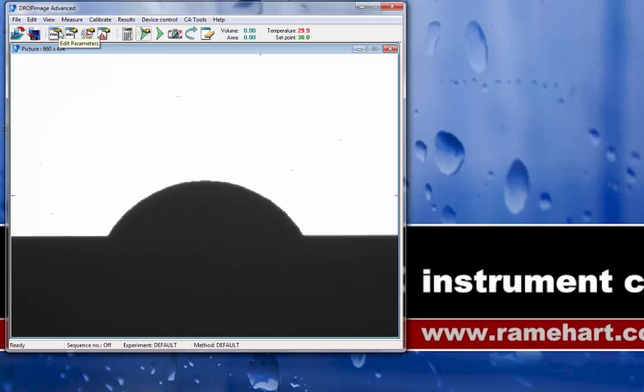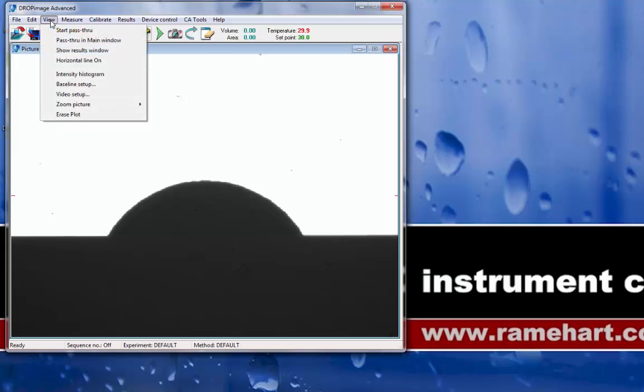This closes out the live video window, and now, when I go back to View, I can change the pass-through setting to the main window by choosing Pass-Through and Main Window.